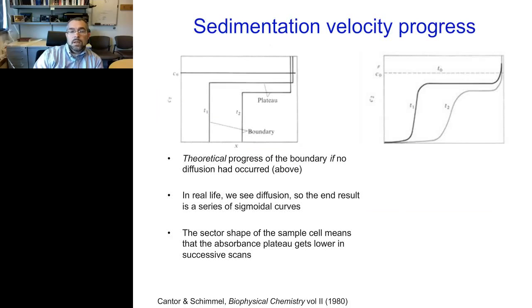All right. In terms of a sedimentation velocity experiment, I showed you some sample data earlier. I showed you that we're watching in real time as our protein moves through our sample chamber. What I'm going to show you is a little more detailed way to think about this. On the left is a theoretical experiment. If we had a global switch and we could turn off diffusion for this thought experiment, this is what you would see.